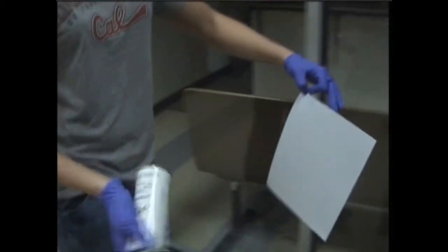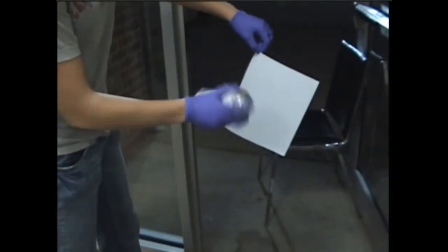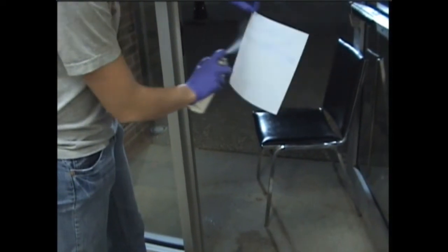What you want to do with this piece of paper is soak the paper down with the chemical. Make sure you get it nice and good.